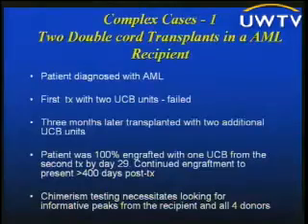There was a patient that was diagnosed with AML, received the first transplant, 2 umbilical cord blood units, both failed to engraft. So 3 months later, this individual was transplanted with another 2 additional cord blood units. Happily for this patient and for us who are trying to follow this patient in the lab, he engrafted 100% in all lineages with 1 of the cord blood units from the second transplant, and still is doing fine, greater than 400 days post-transplant. However, every time we do receive a sample in the lab, we have to look for informative peaks for all the donors.